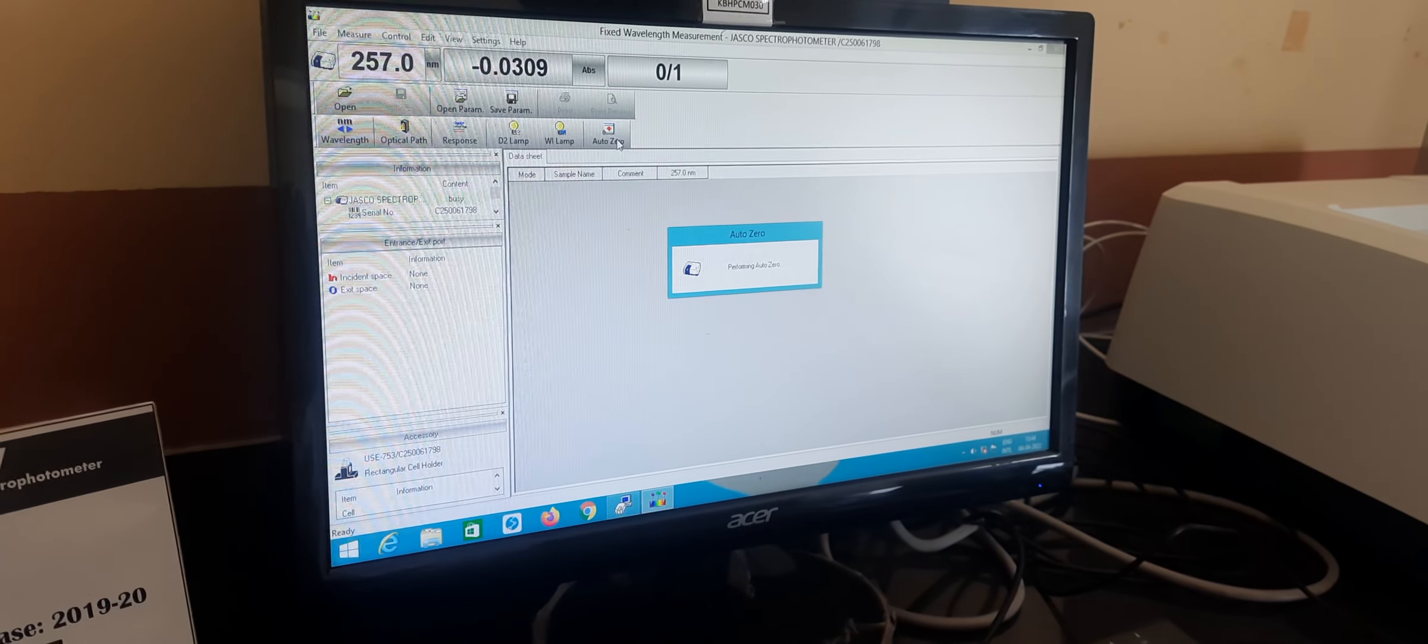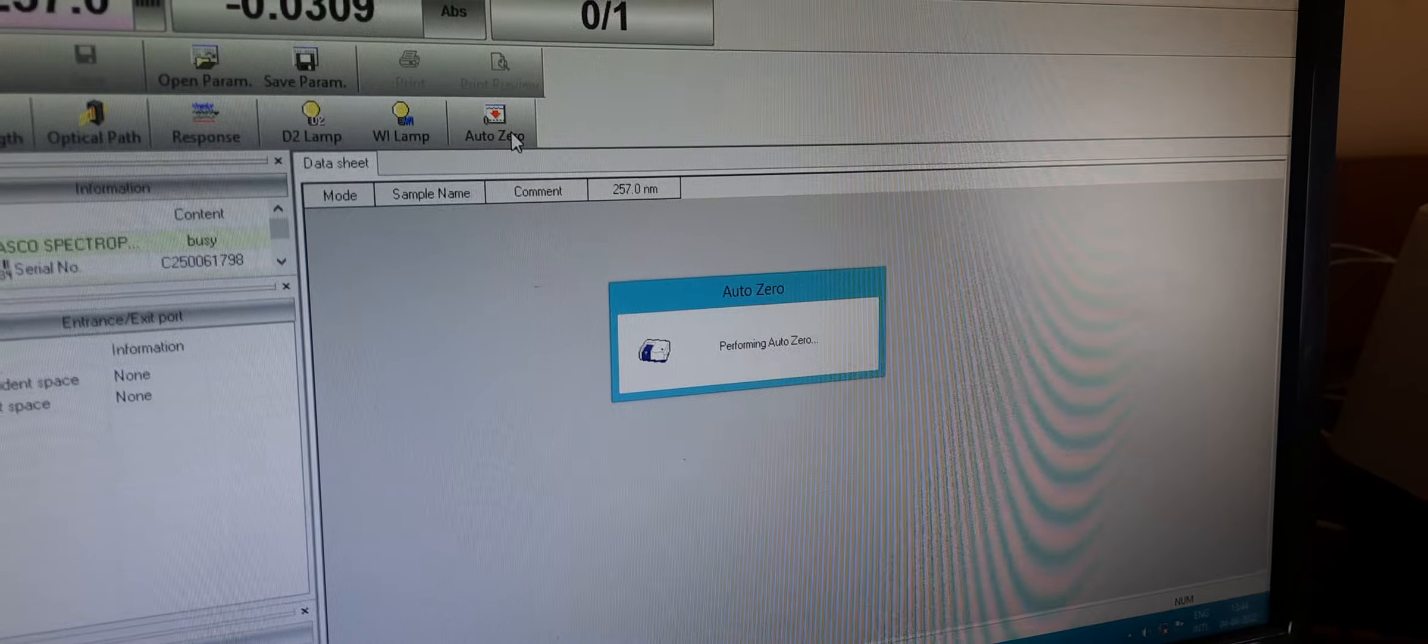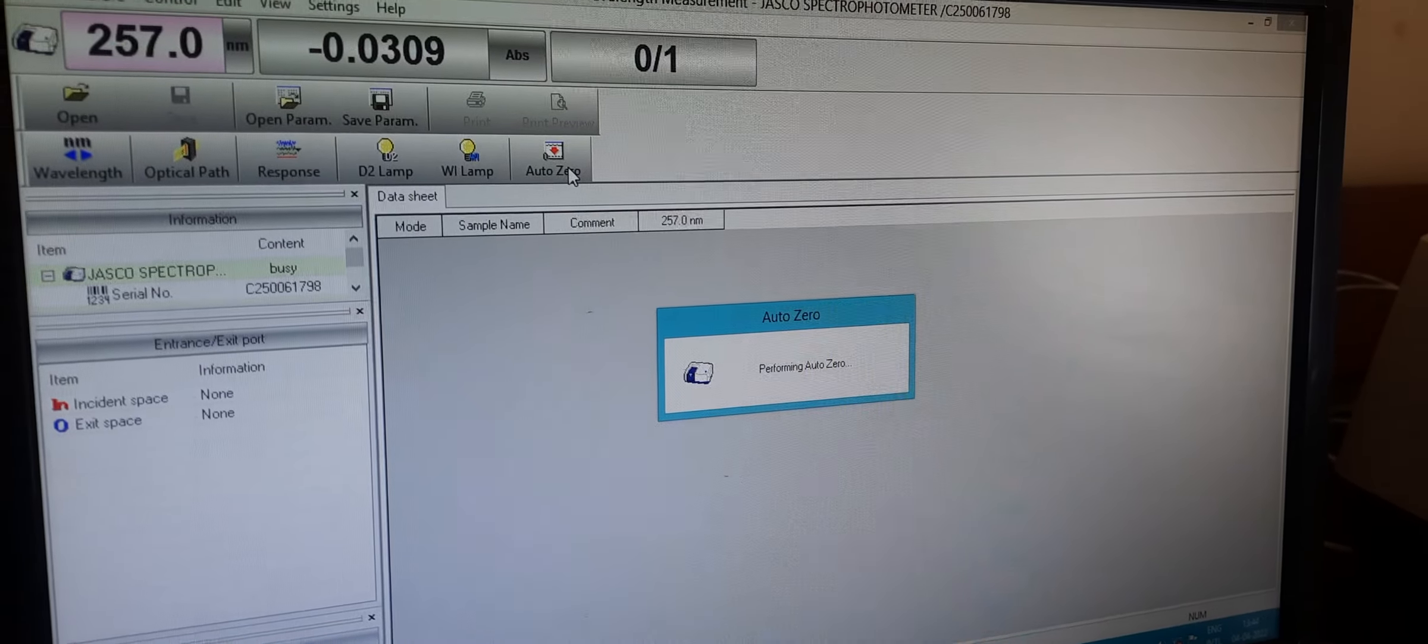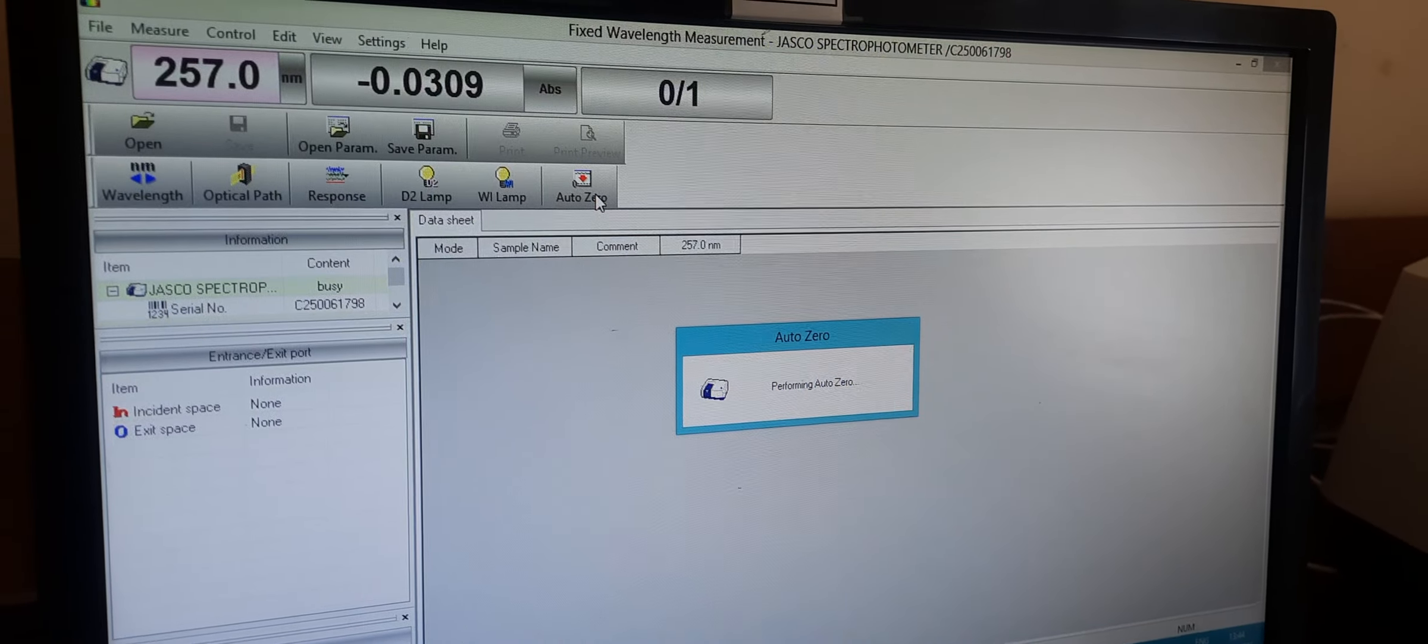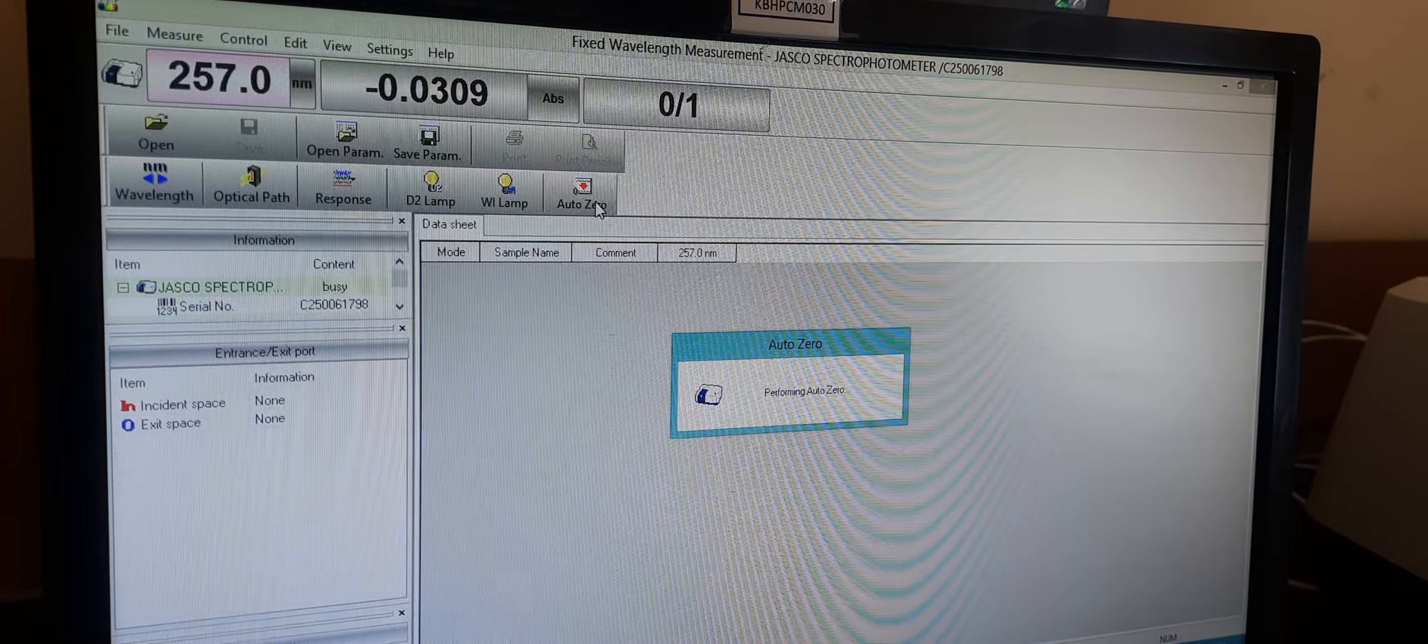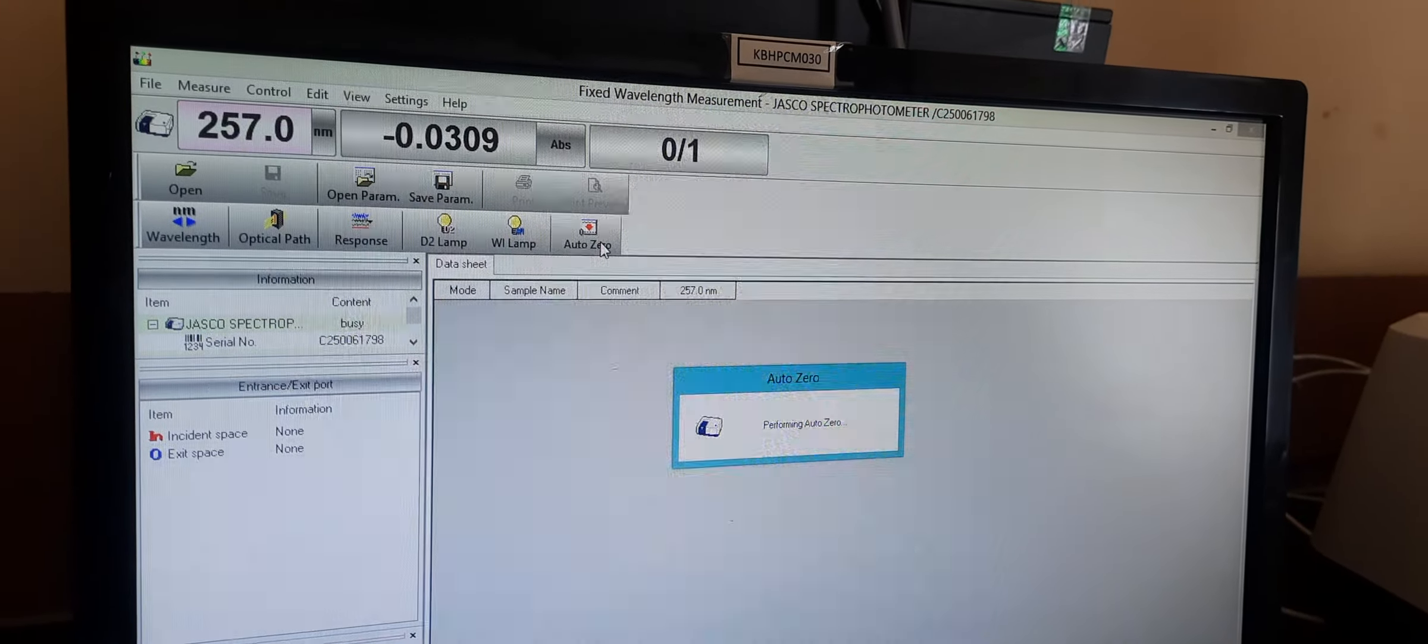It takes a few seconds to do the auto zero, which performs the baseline correction.